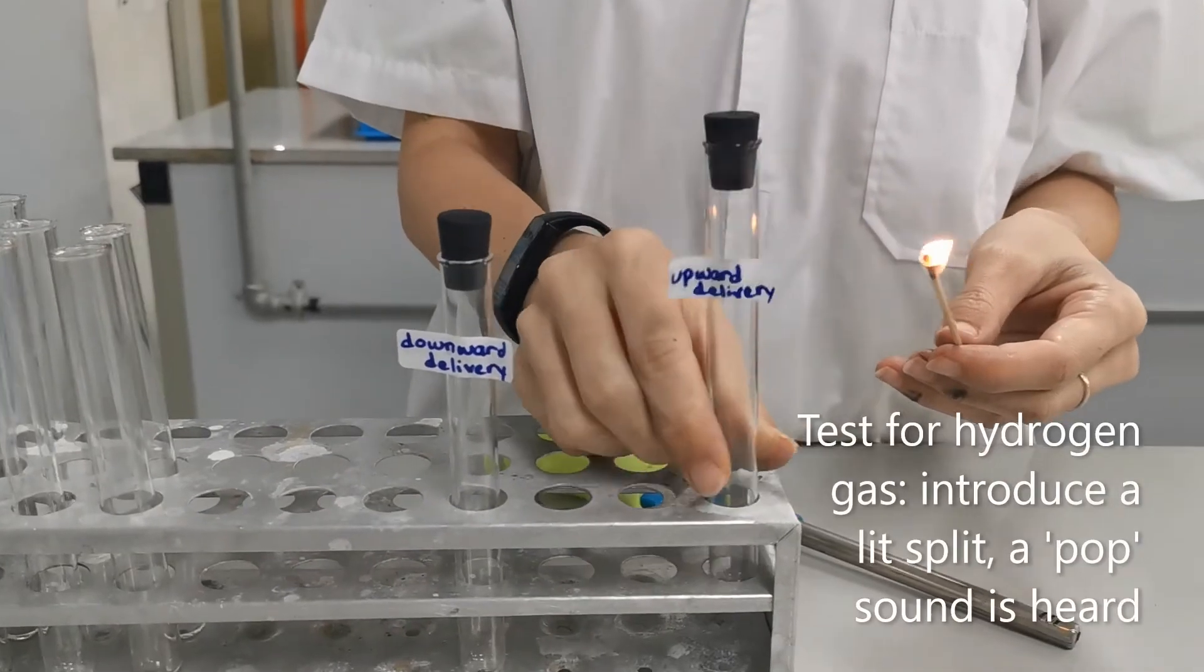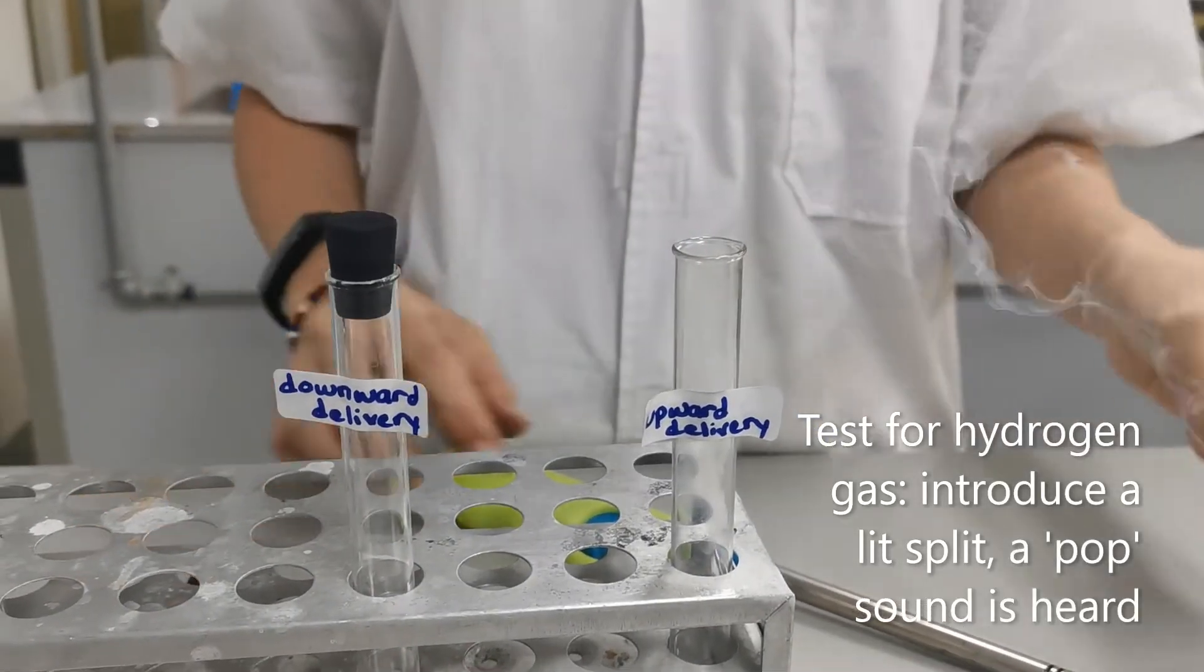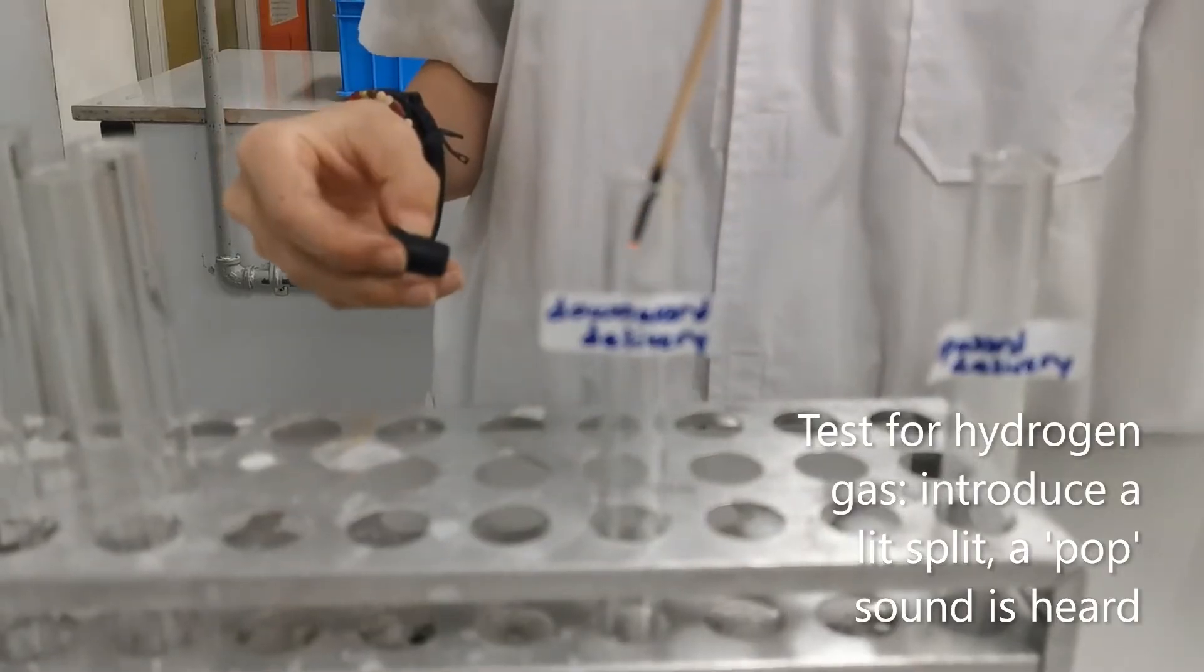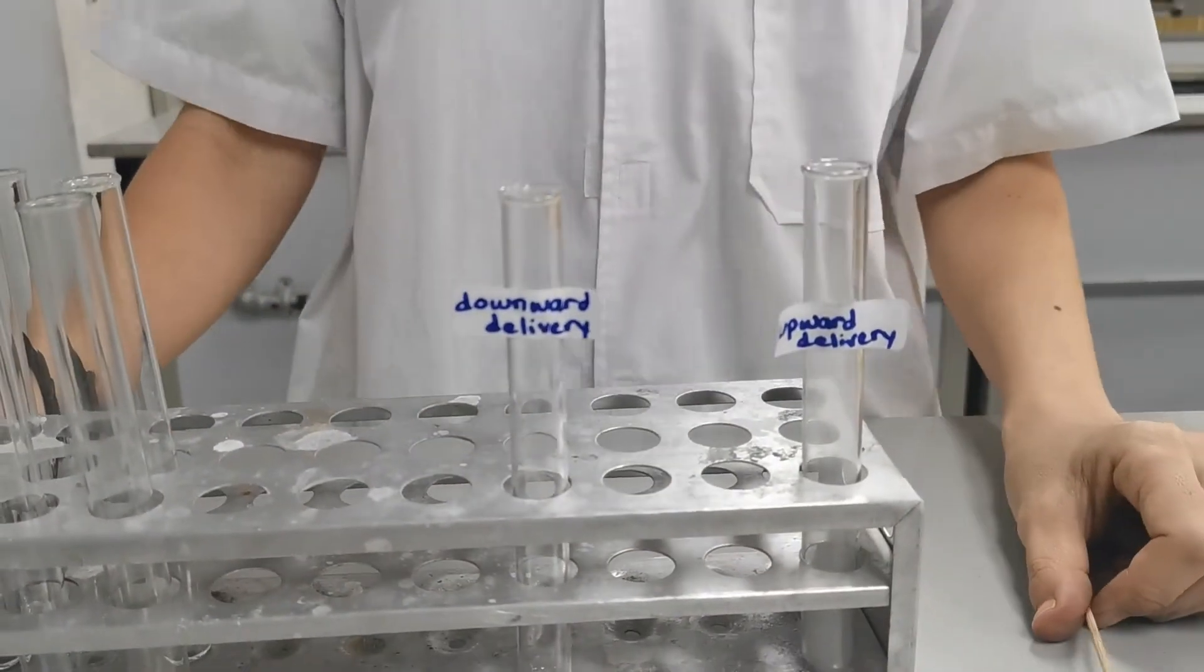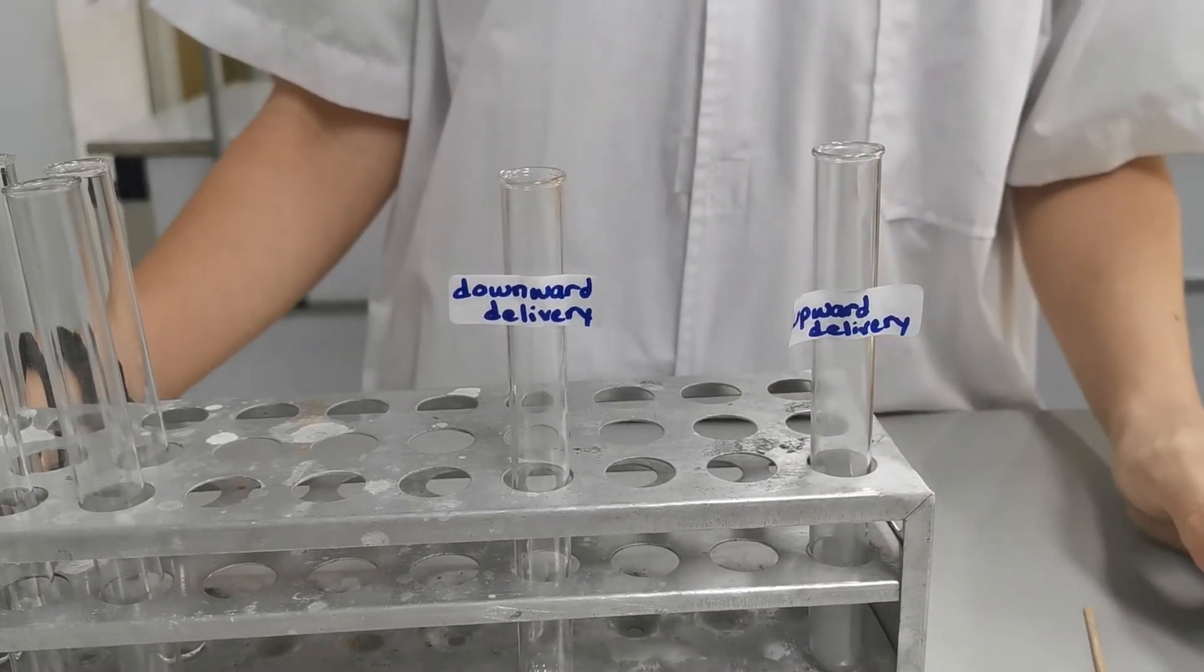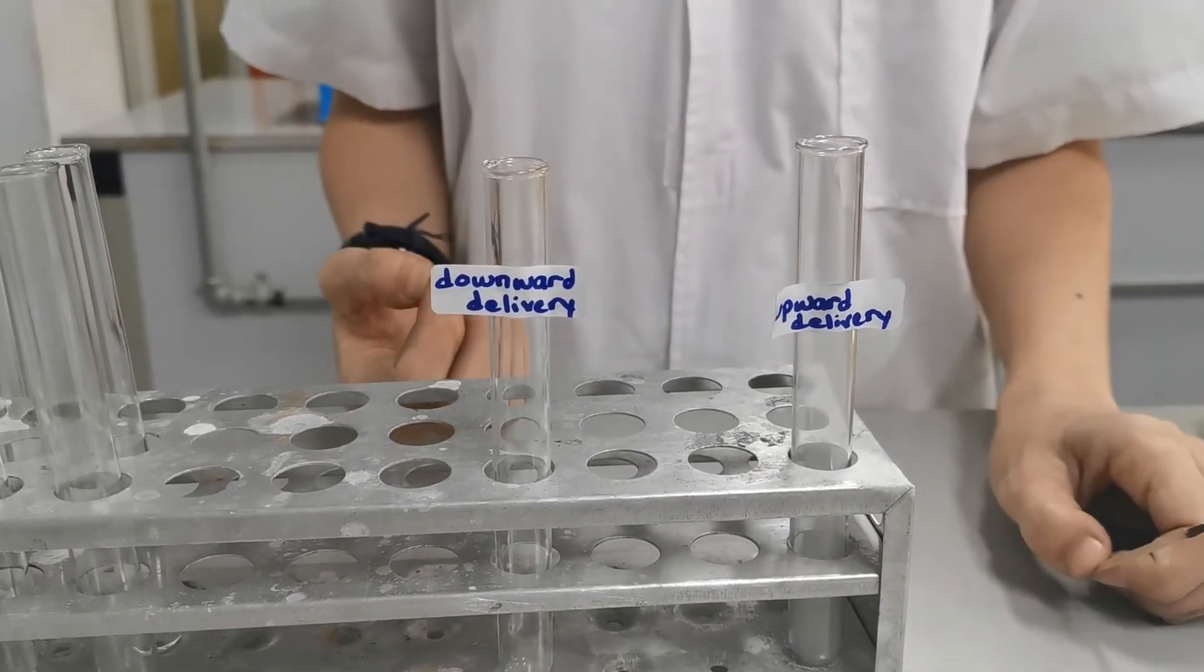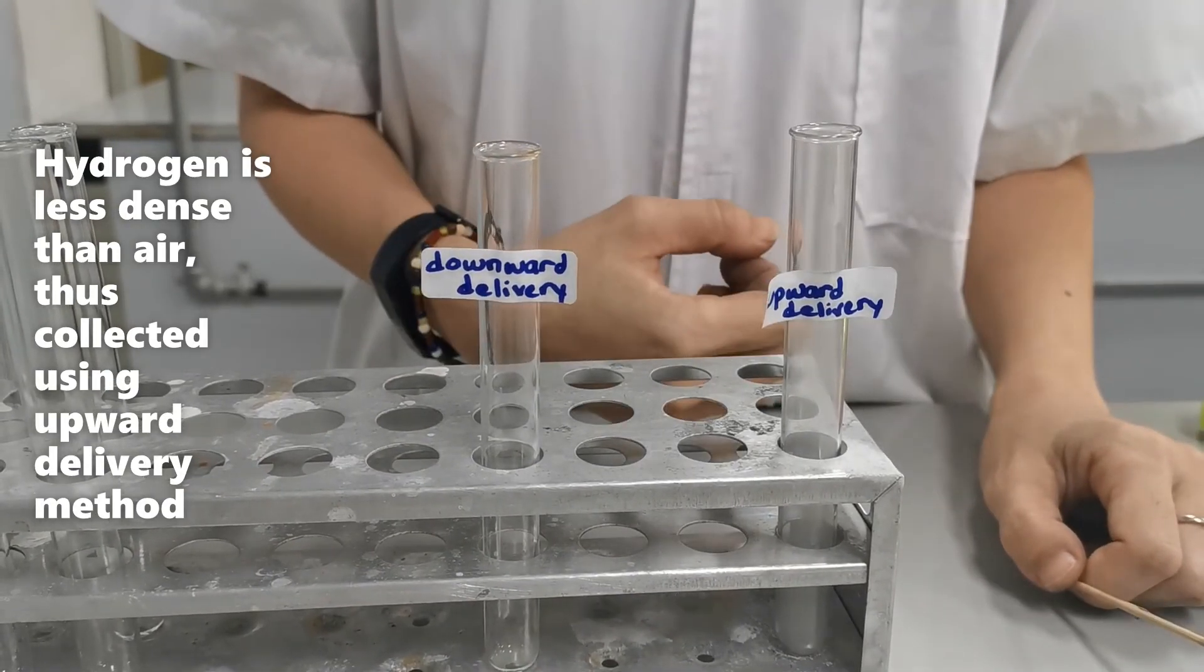Let's compare which tube contains more hydrogen gas. We can see that the upward delivery method collected more hydrogen gas because we heard such loud noise, a pop sound. But downward delivery method did not give us that pop sound. So for hydrogen collection, upward delivery is much more effective.